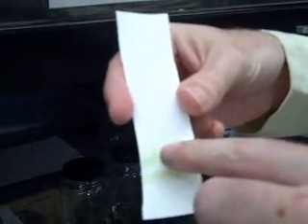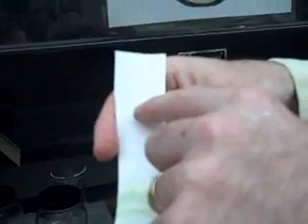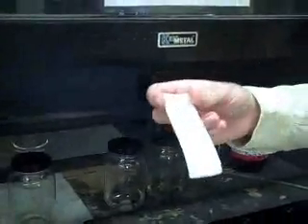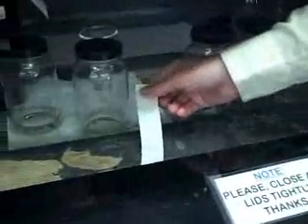And the heaviest band is one of the chlorophylls, and it's the very bottom. So that's the heaviest band of photosynthetic pigments. And we have a lighter one here. We have a light yellow one here, and we have the very lightest photosynthetic pigment at the top. So one here, one here, one here, and one here. They haven't separated out completely. The bottom 3 haven't. Okay, so that is paper chromatography. We're separating out our 4 photosynthetic pigments: chlorophyll A, chlorophyll B, xanthophyll, and carotenoid.